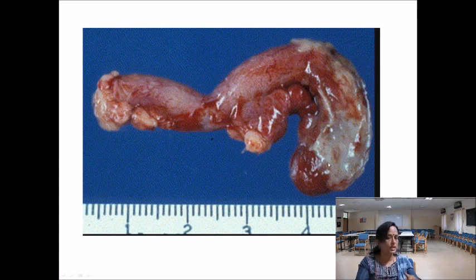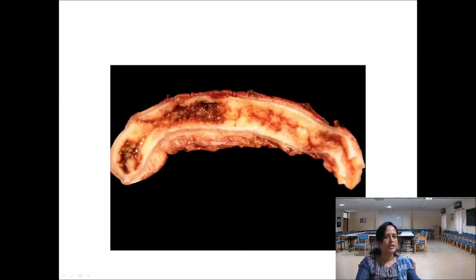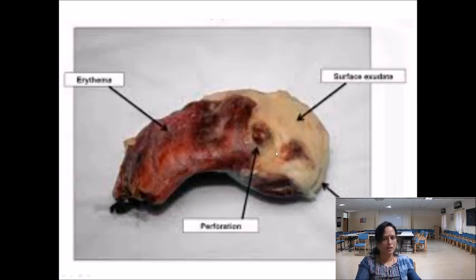In the previous two we didn't see this. See, this is again the purulent material and congestion. So in the cut section we can make out the lumen has irregular areas. So here it appears to be obstructed, with hemorrhage and necrosis. This is the entire longitudinal cut section of the appendix.